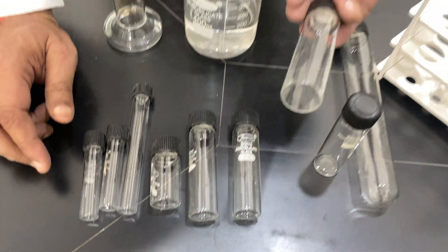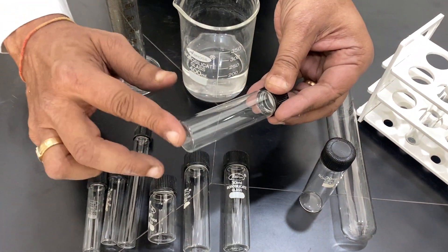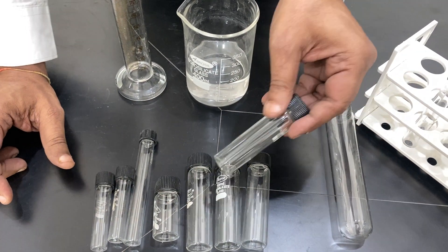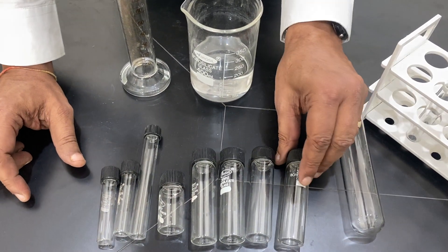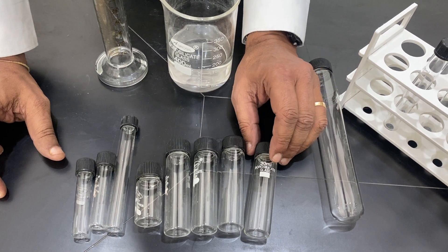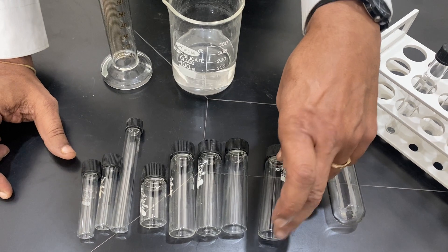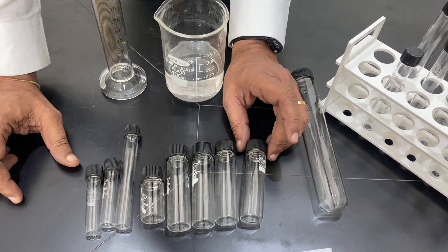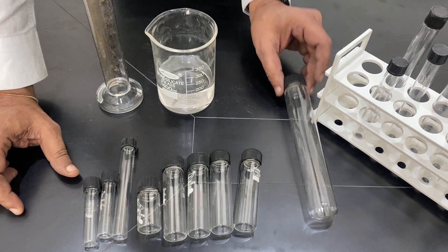They also come plain without any graduation — flat bottom but plain, no graduation at all. Another option is with graduation. You can see there is a white place to put the mark, blue silicate glass, and 1 ml graduation. The volume markings can be approximate or up to the total capacity, depending on the requirement. This is totally autoclavable.